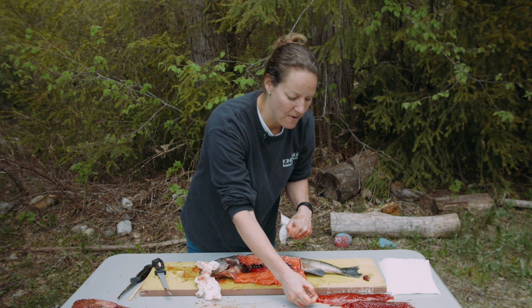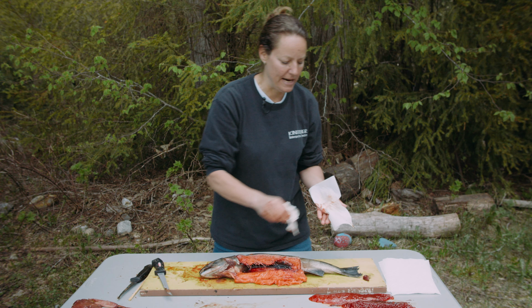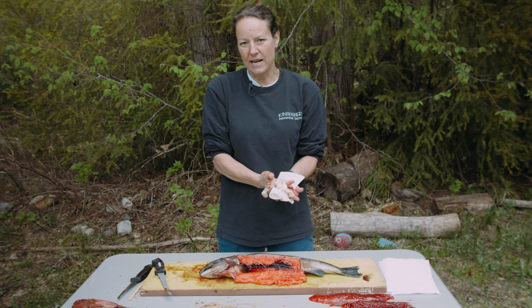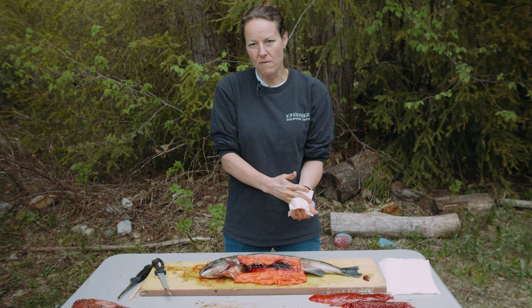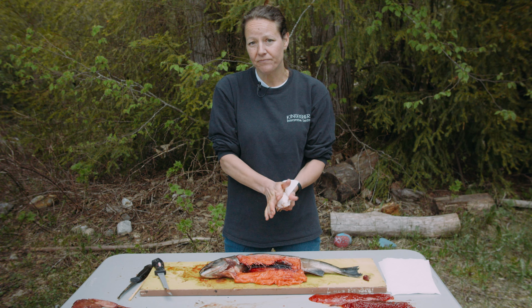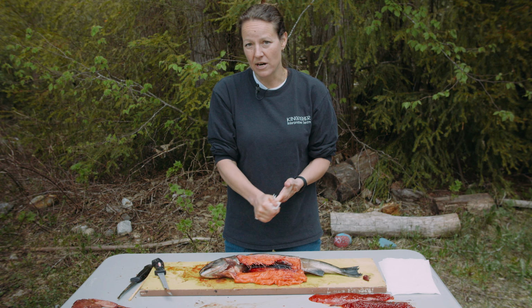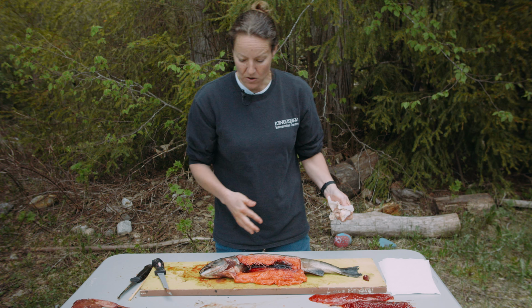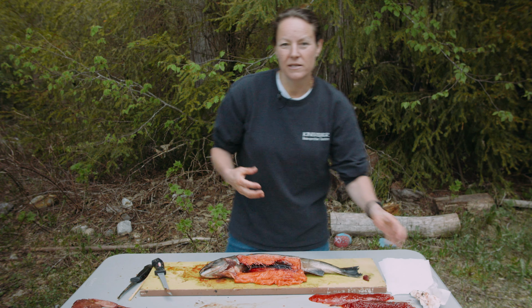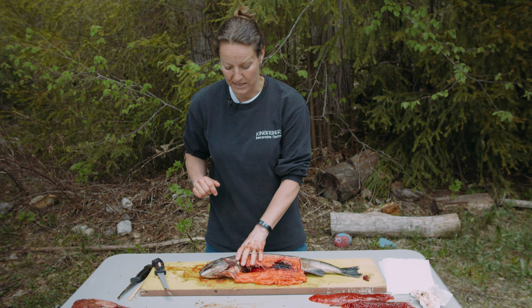Excellent. Now, the one final thing that I'd like to show you today, boys and girls, is the fish's brain. So the brain of a salmon might be a little smaller than you're expecting because these are what we call reactionary animals. They don't need to learn a language. They don't need to learn how to tell time. They certainly don't care what they're wearing. So these animals are born to survive. All right, so with that being said, let's have a look inside the fish's head.